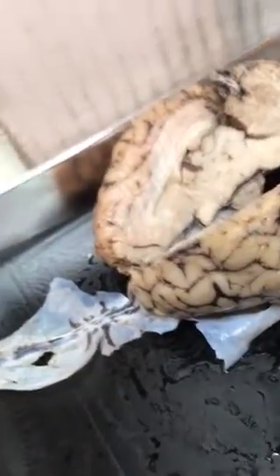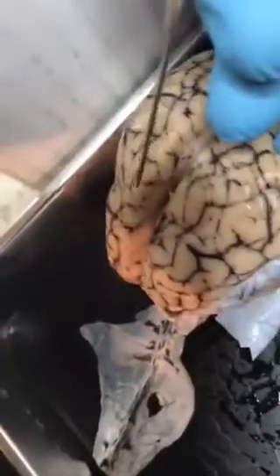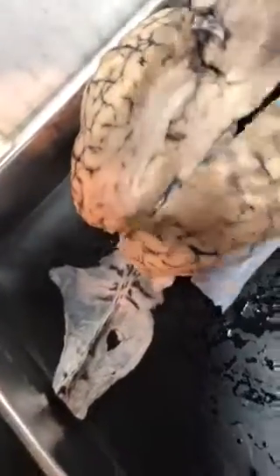The longitudinal cerebral fissure, which is now dissected, is this. Let's see. Here we go. The longitudinal cerebral fissure is the fissure that divides the cerebrum into the two lateral halves.